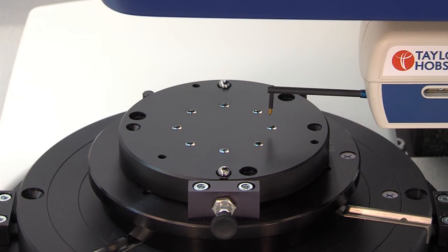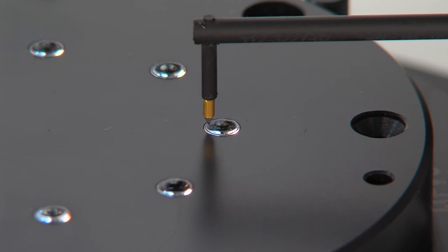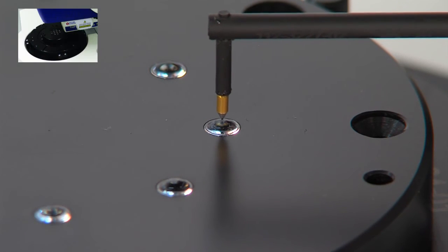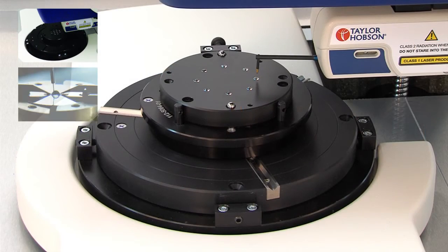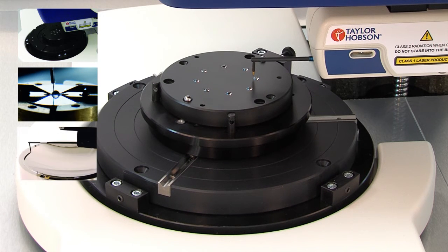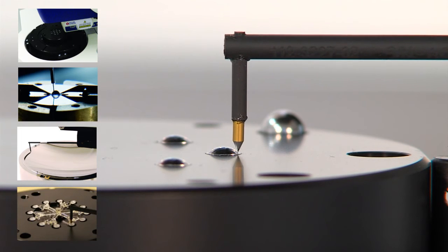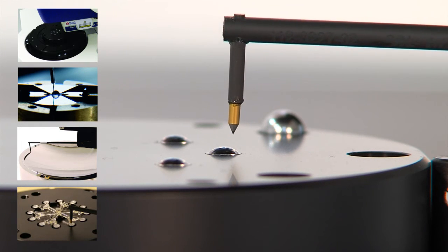The PGI Matrix can be programmed and configured to work with any layout of parts. It can be used for batch testing of multiple parts, single components, large diameter optics, and is ideal for traditionally awkward products such as lens trees.